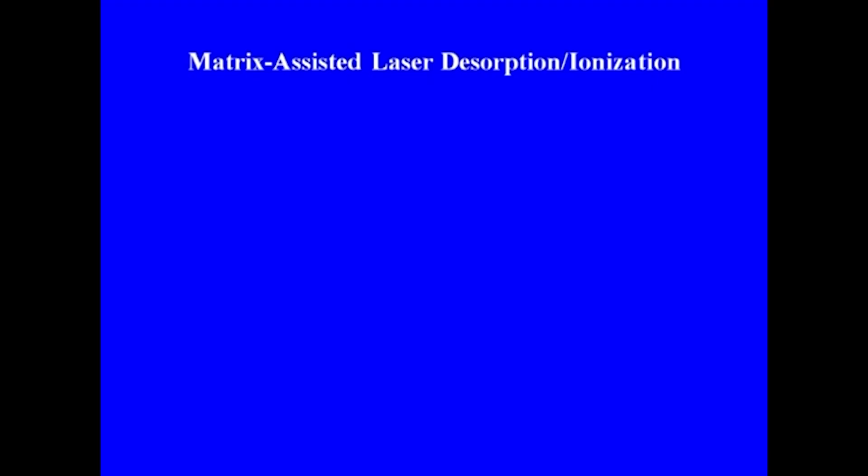Then there is matrix assisted laser desorption ionization, an efficient and directed energy transfer during a matrix assisted laser induced desorption event, and this provides high ion yield of the intact analyte and allows for the measurement of compounds with sub picomole sensitivity. In addition, the utility of MALDI for the analysis of heterogeneous samples makes it very attractive for the mass analysis of complex biological samples such as protein or proteolytic digests.